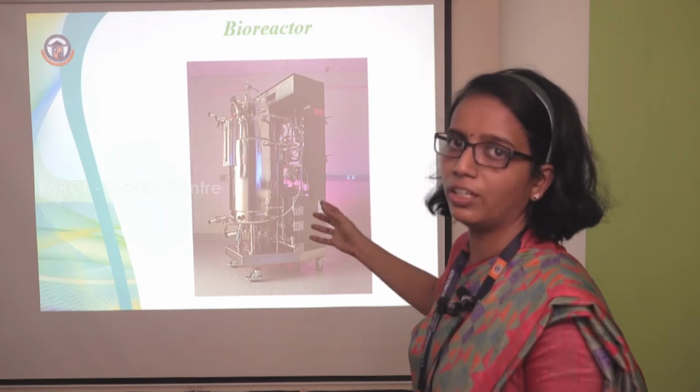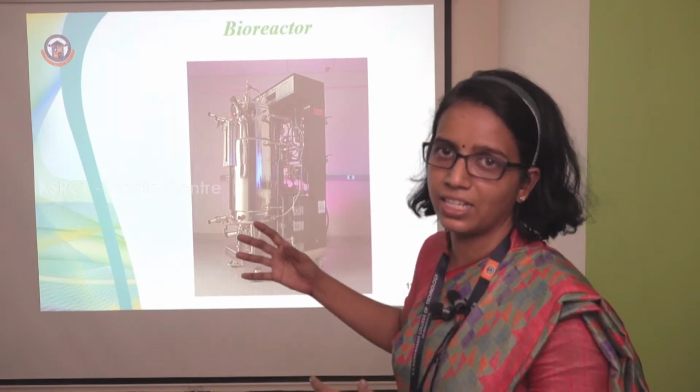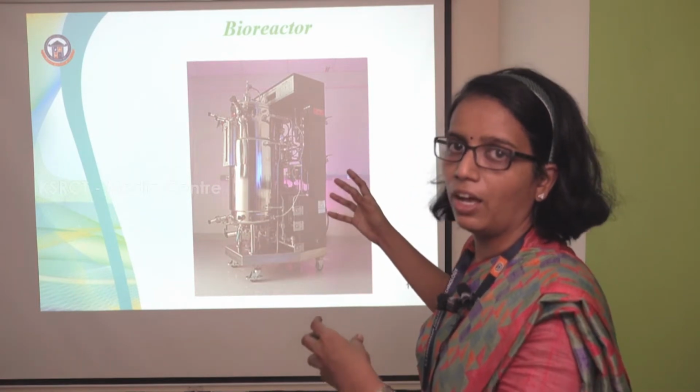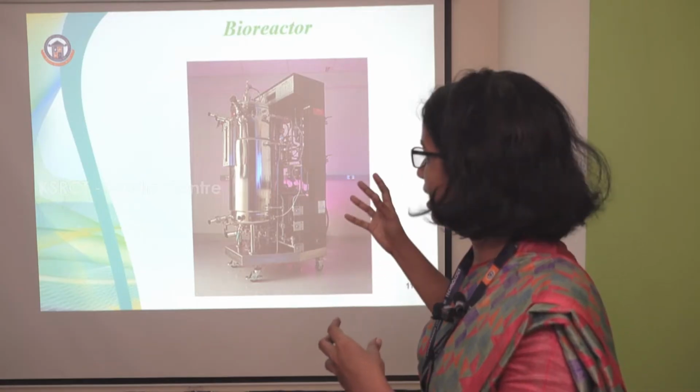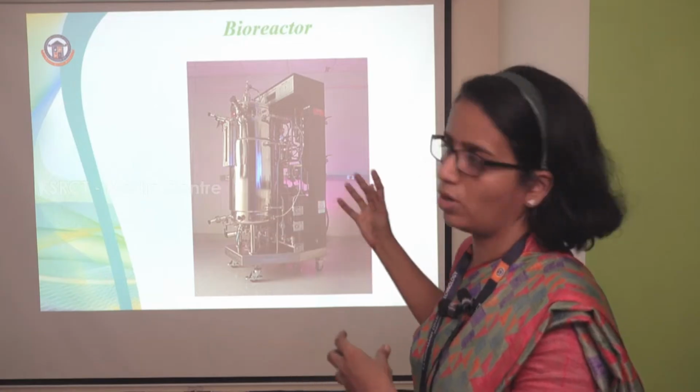And this is how the fermenter will be in the industrial setup. It will be placed in a particular area, not in a fixed mode. It will be enabled for transporting from one place to another place.